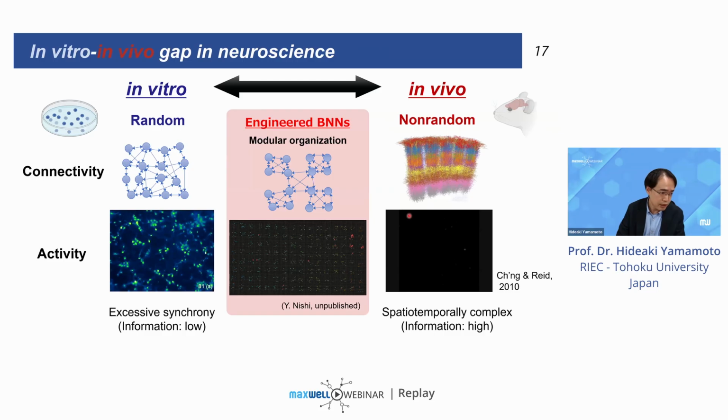So to make a short summary up to this point, what we're seeing here is not exactly the same as what scientists observe in vivo, but we're beginning to be able to bridge the in vitro networks closer to the in vivo networks by using cell engineering technologies.